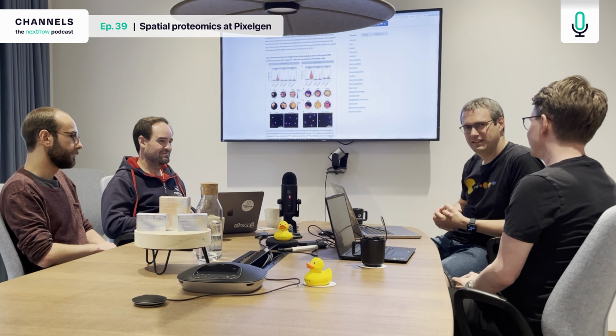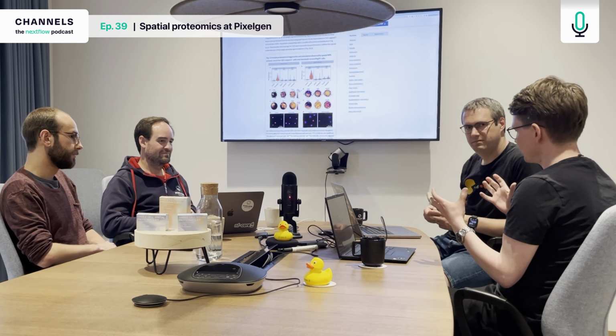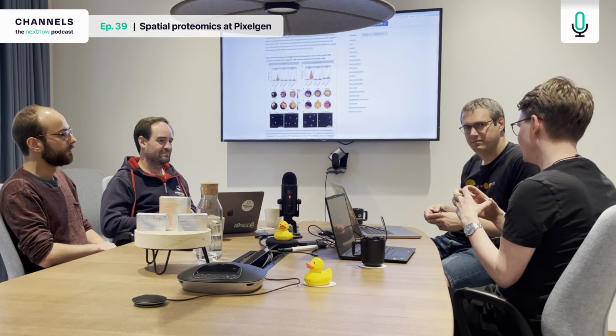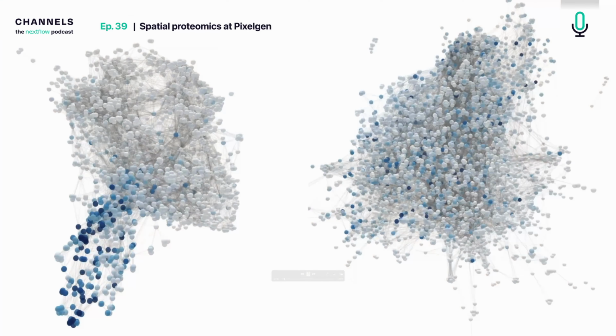And then you can make a lot of different choices on exactly how to do that. For some purposes, like visualization, it makes it clearer when you project it on a sphere, but you can also allow it to just stay in some other type of 3D graph representation. So we can create these kinds of representations.